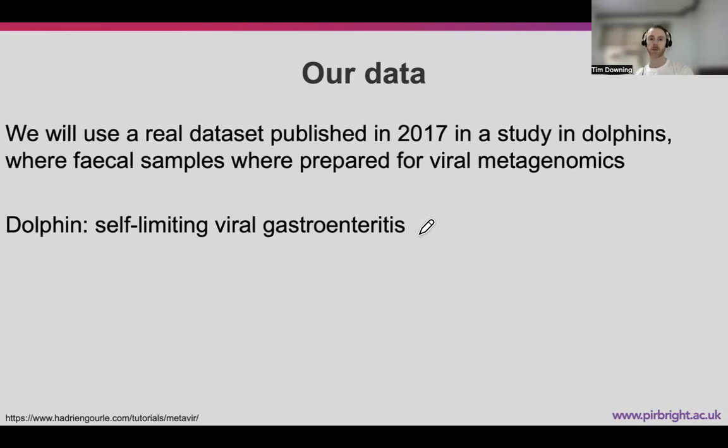Our data is real data from a 2017 study in dolphins, whose data I borrowed, where the fecal samples were prepared for viral metagenomics. So there's a question over whether there's any bacteria present. And we know that the dolphins had some nasty gastroenteritis virus that was affecting them.